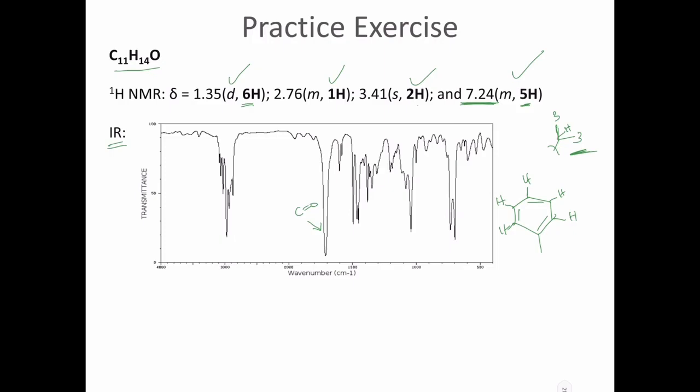So that means at 3.4, this compound could have the 2 protons being here and there, and then we have a carbonyl over here, and then we have this other group, CH3, and okay, and then there's a proton over here. Okay, so we have accounted for this one.